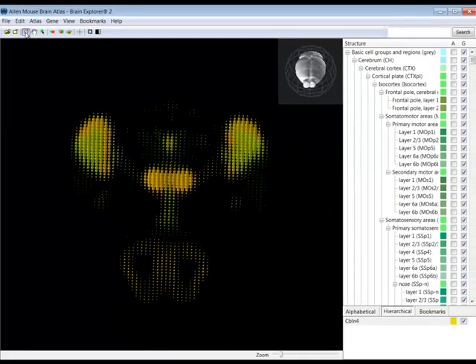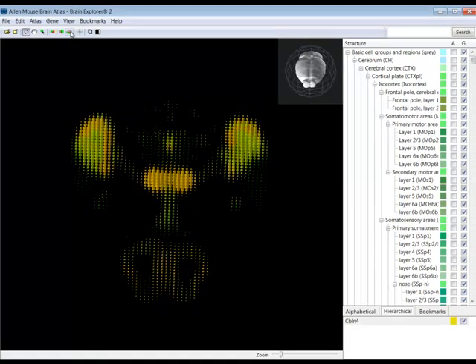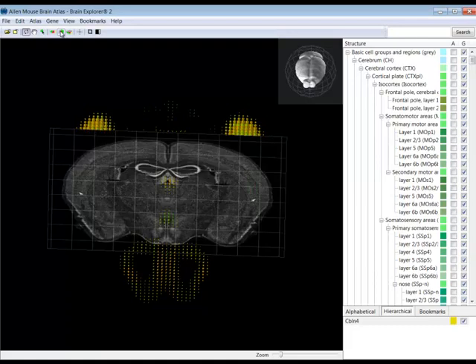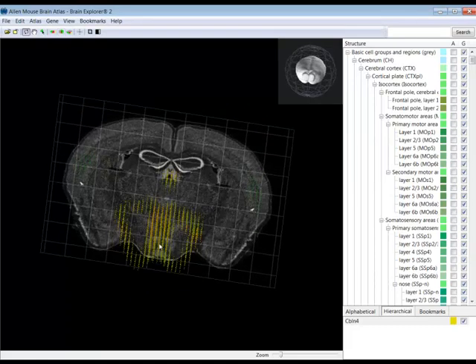You can add context for the pattern of gene expression by adding a coronal, sagittal, or horizontal Nissl section. Here, I've added a coronal Nissl section.